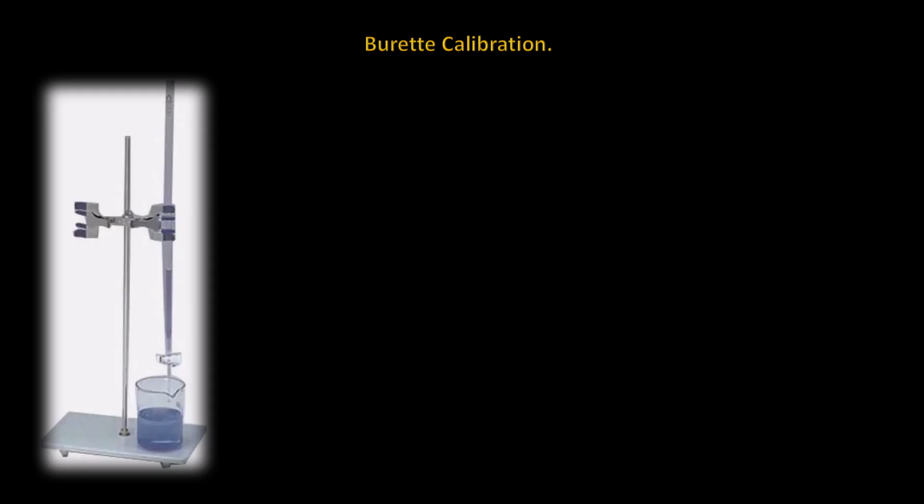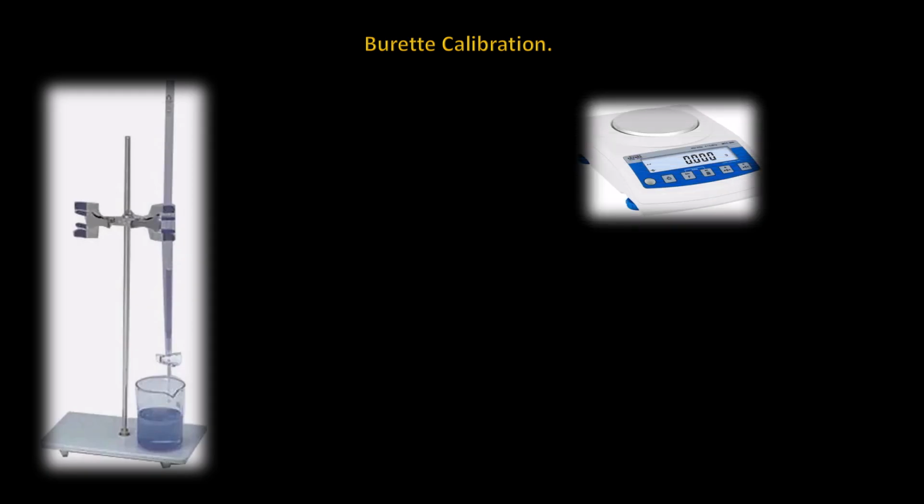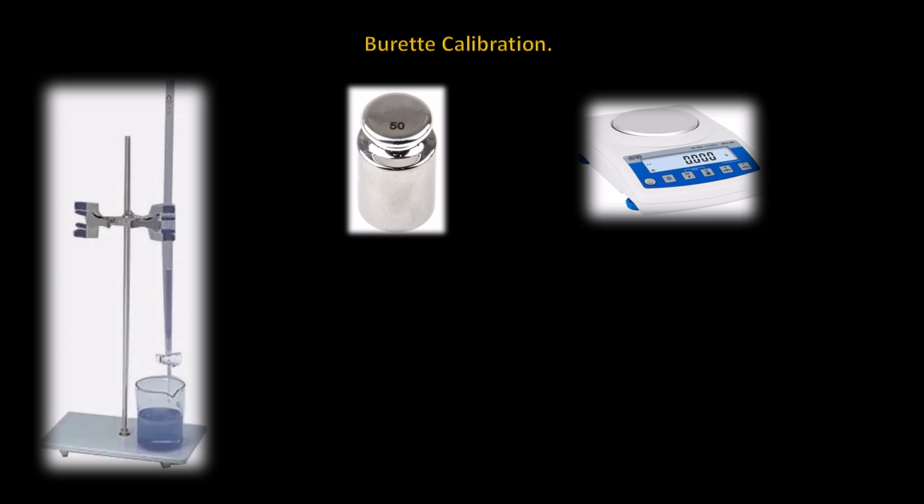The laboratory scale that you will use must first be calibrated with a calibration weight that is recommended by the laboratory scale's manufacturer. Now, these weights are considered to be extremely accurate in weight. It will also be used to determine the weight's density.